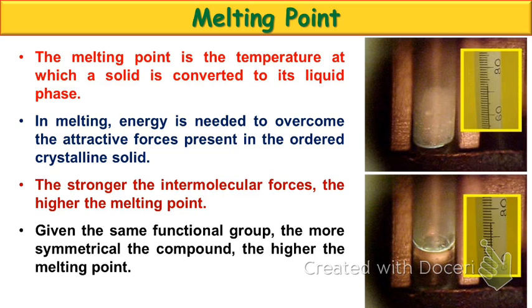Okay, we'll look at the melting point. What's happening at the melting point? What are you doing? Okay, we heard a couple answers there. I'm going to, of course, highlight the wrong answer. Breaking bonds. Are we breaking bonds in this case? No, we're going to break the intermolecular forces that are holding those individual molecules together.